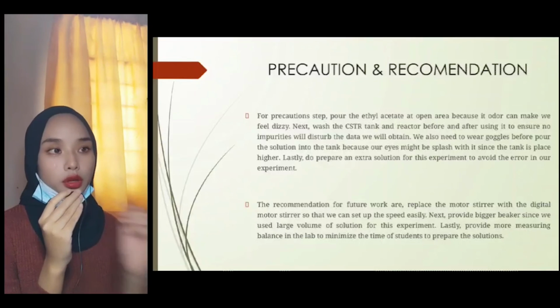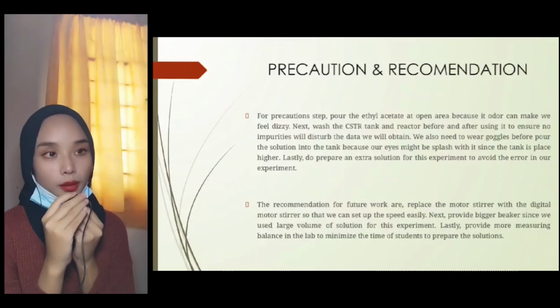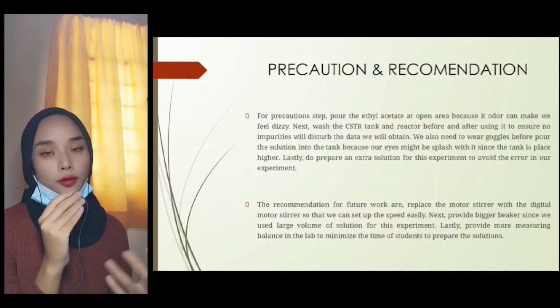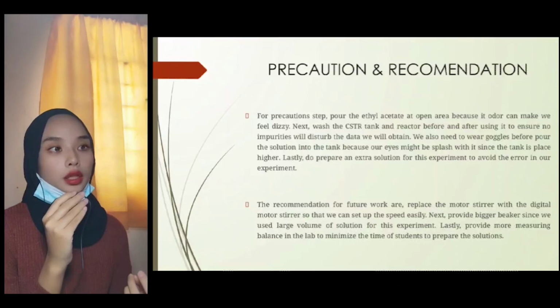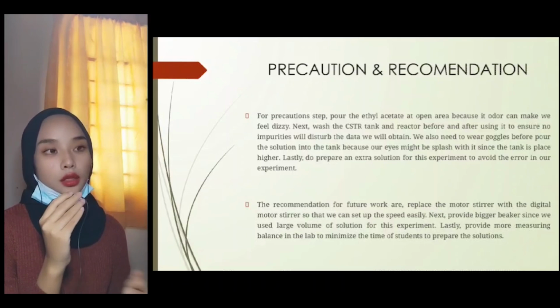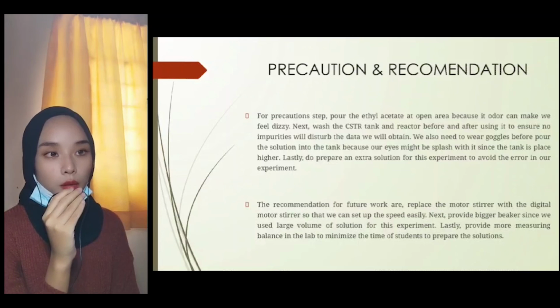For the precautions and recommendations: for precautions, pour the ethyl acetate in an open area because its strong odor can make us feel dizzy. Next, wash the CSTR tank and reactor before and after using it to ensure that no impurities will disturb the data we obtain.